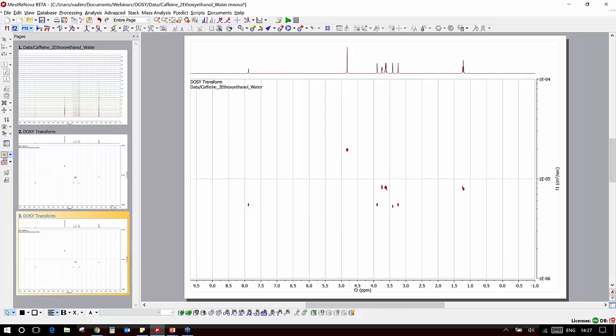They pretty much give the same results, but the peaks look a little bit more rounded, mostly because they are synthetic peaks in this case. So you basically see an analysis result rather than the point-by-point analysis of the Bayesian transform. But essentially the results are more or less the same in both situations.